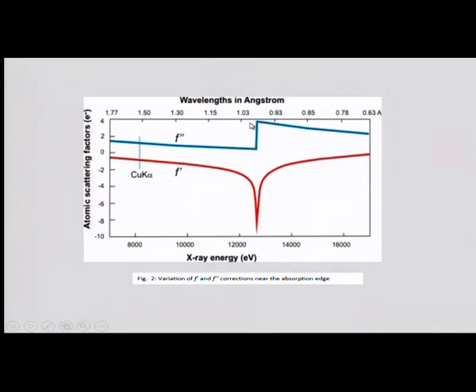So, now this is known as the peak point, this is known as the inflection point. You can collect data at either this energy or this wavelength or at this wavelength. One is called left remote, another is known as right remote. Usually, when detector technology was not that great, people used to collect at 3 wavelengths.